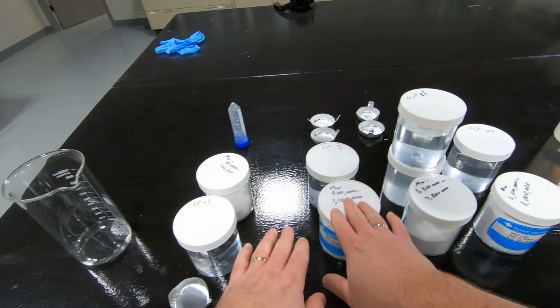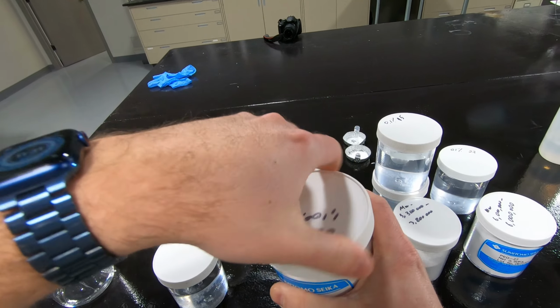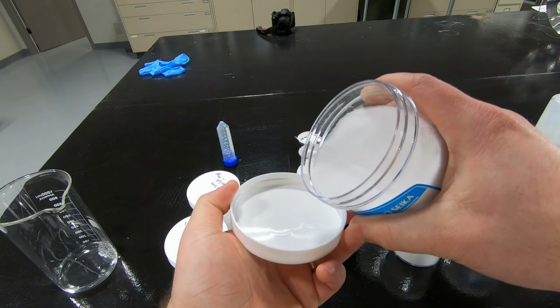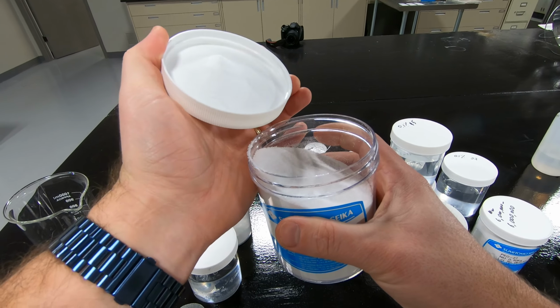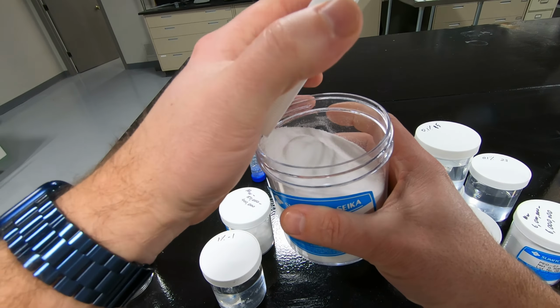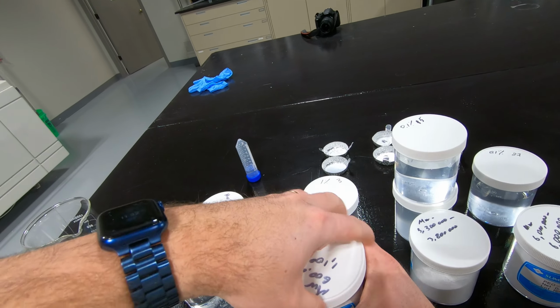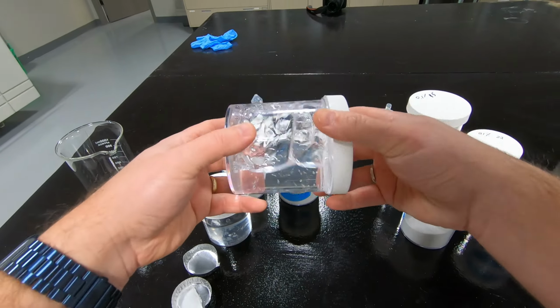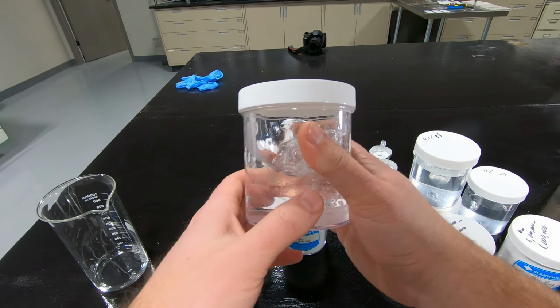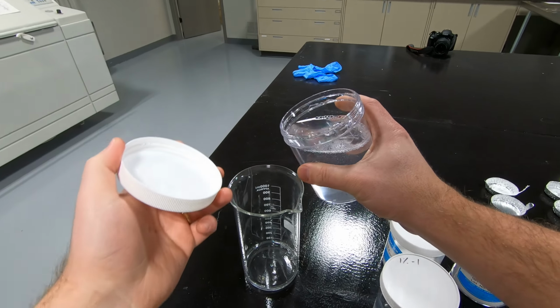It's a hydrophilic polymer. When you add rapidly to the water, you will create clogs, and in order to achieve this total dissolving, the polymer must first be completely dispersed in the water.